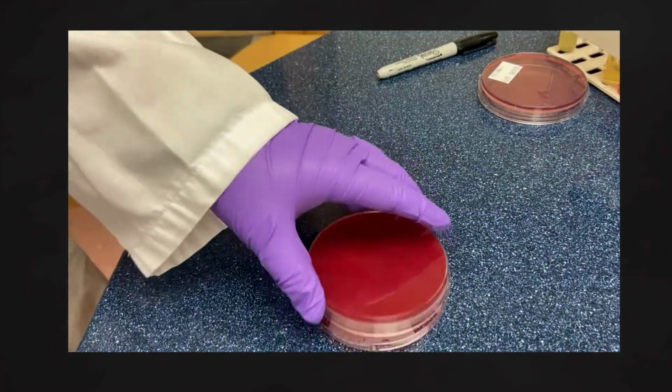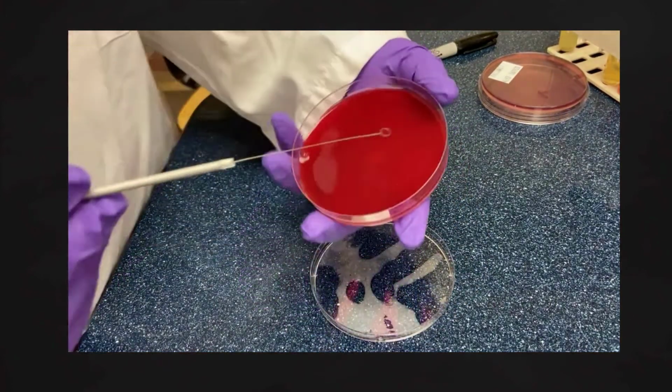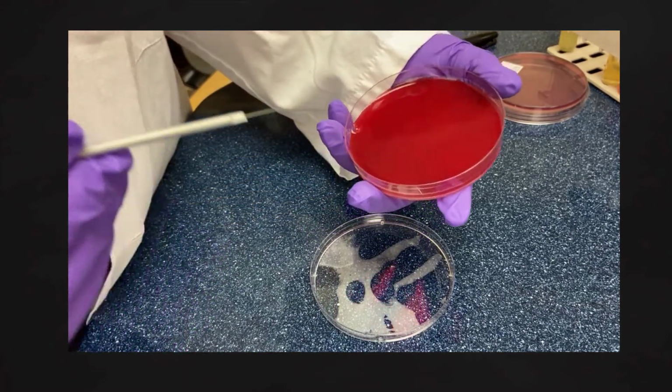It's not like what we saw with the streak plate where we went back and forth all the way down the plate. It was just in one area. Now I'm going to take my sterilized loop and make a zigzag pattern across that line.